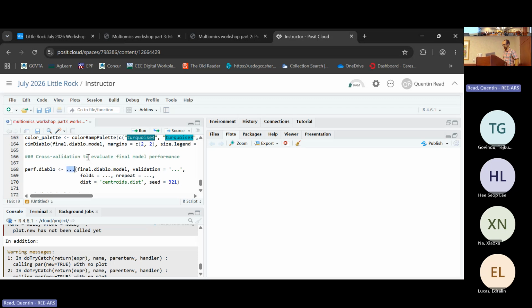But yeah, the last thing I wanted to do before we try to play with showing the heat map is to basically evaluate performance of the final model and see how well it predicted the time points from the original data using one final cross-validation step on the final model. The rationale behind doing that, again, I said we're not really in this for predictive purposes.